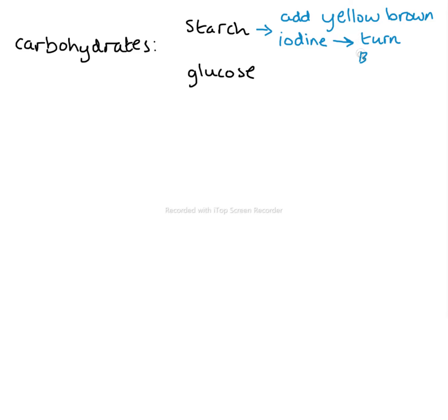Black, blue. So put it this way: black, blue, or blue, black. They accept it both ways. So that's for starch.